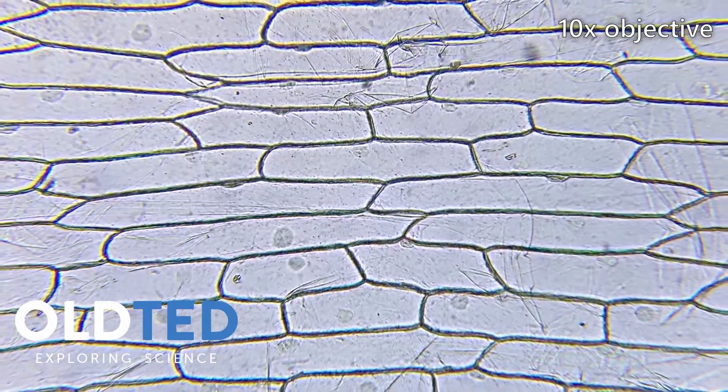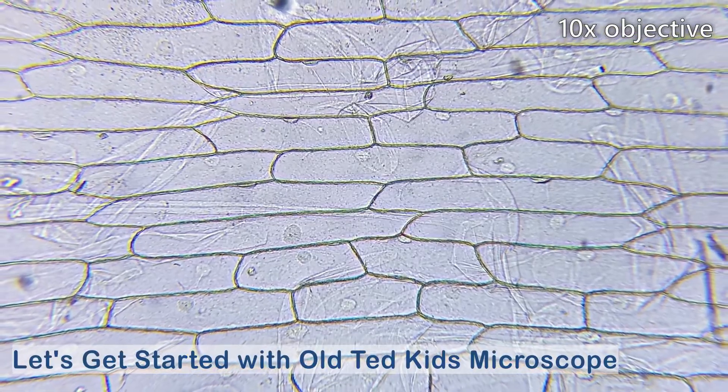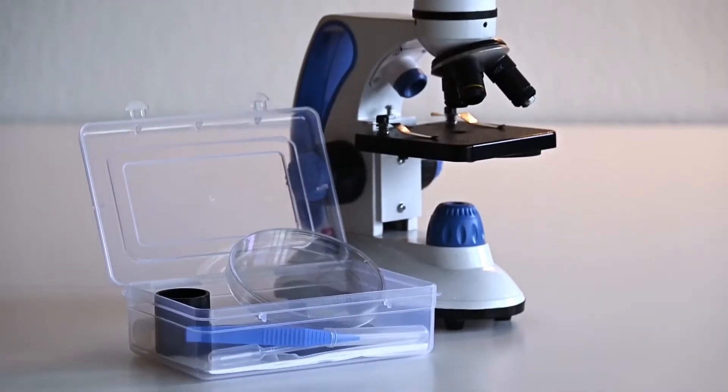This is a single layer of plant cells from an onion, and today I'm going to show you how you can prepare and observe this sample on your own using the OldTed Kits microscope and the included lab kit.